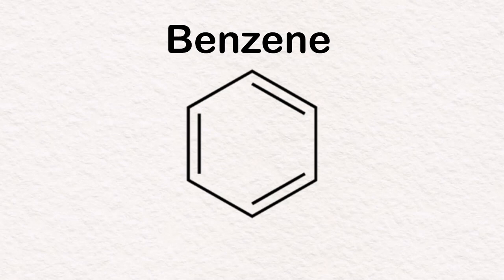In today's video I will be making benzene. To compare with other youtubers I will follow the same method but in a larger scale and see if it works out.